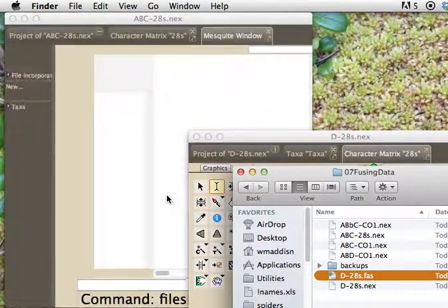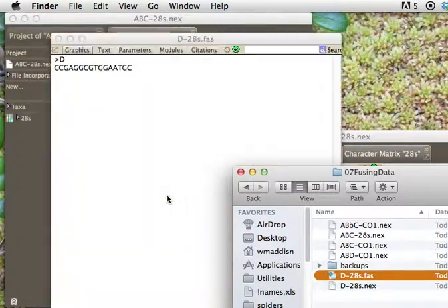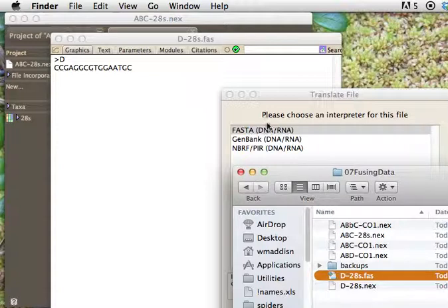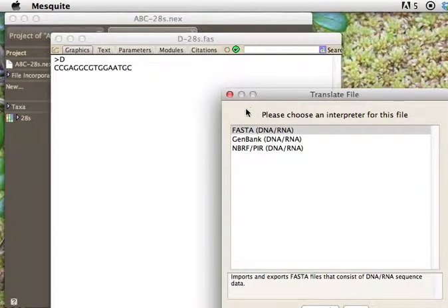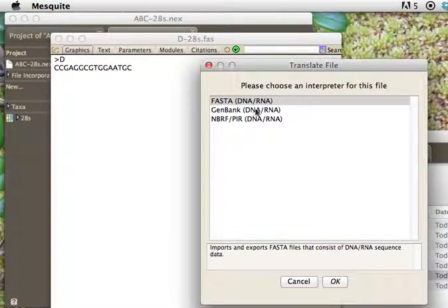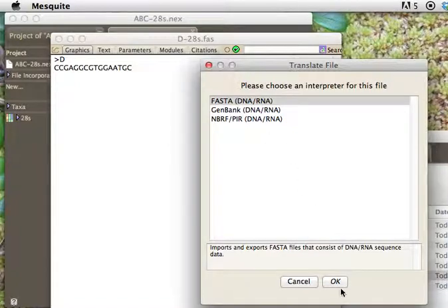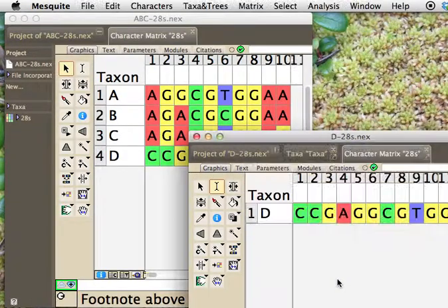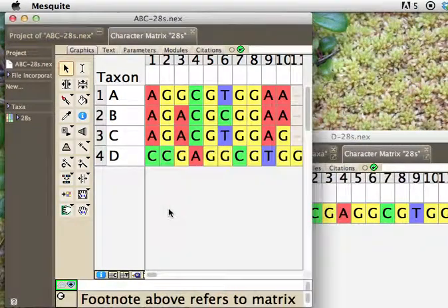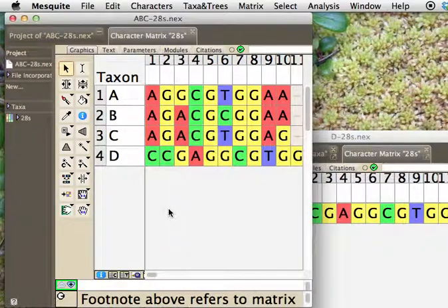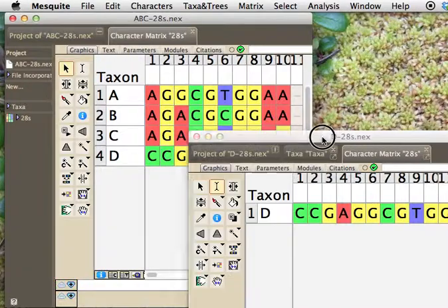Mesquite notices it and says, what sort of sequence is this, and it'll give you a couple of options, so those are the ones that it can input. You say OK, and it puts it in, and it adds it in. So that's one way to do it.